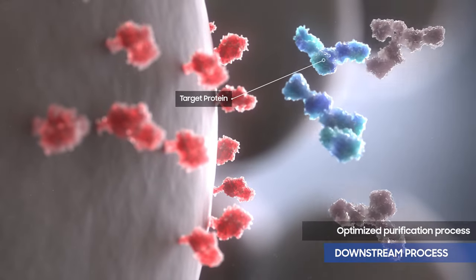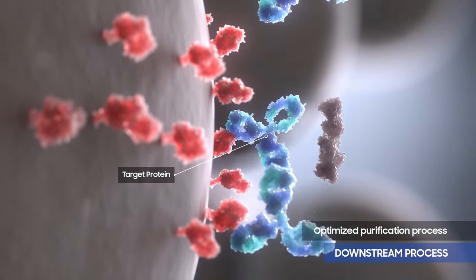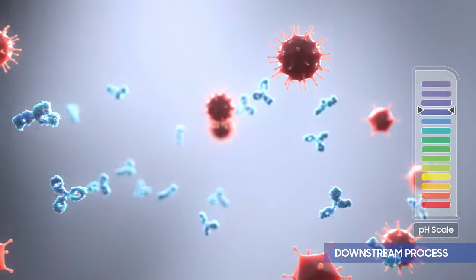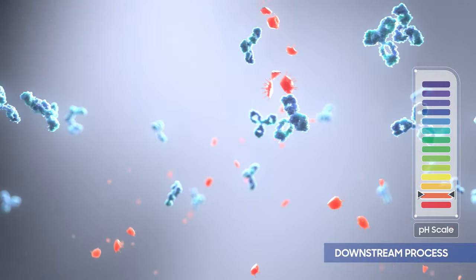Your target protein can be isolated through chromatography steps such as affinity and ion exchange resin in the downstream process. Impurities and viruses can be removed through chromatography and filter steps.